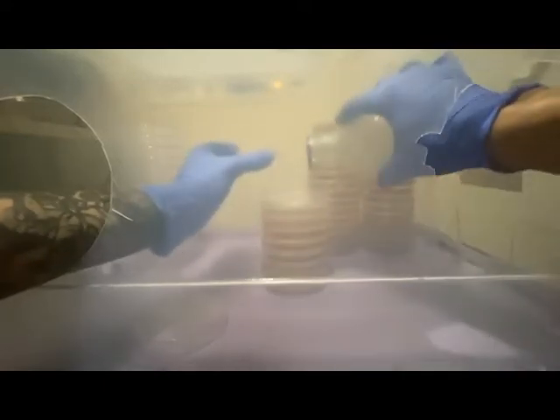Yeah, that's pretty much it. Oh, those are trash. That's okay. And with working in an SAB, it does get a little foggy in there. Takes some practice getting used to seeing through fogged glass. It is what it is, though. You know, we make the best of what we can.